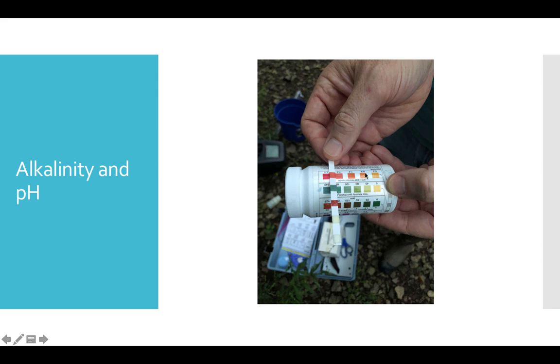The pH we look at next. Our pH didn't vary much; it's about 7.8 here. So our pH being about 7.8 is pretty good, neutral being 7. We expect it to be a little on the higher side with those higher alkalinities in there, which neutralize some of the acids and maybe even make it a little bit basic.